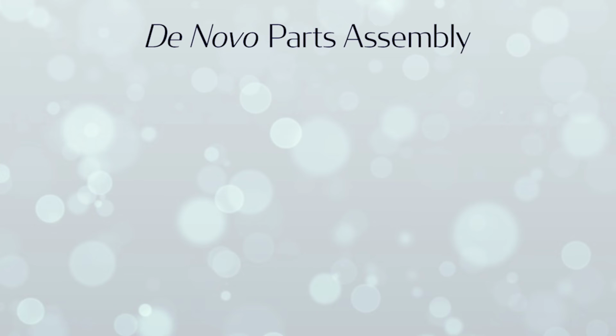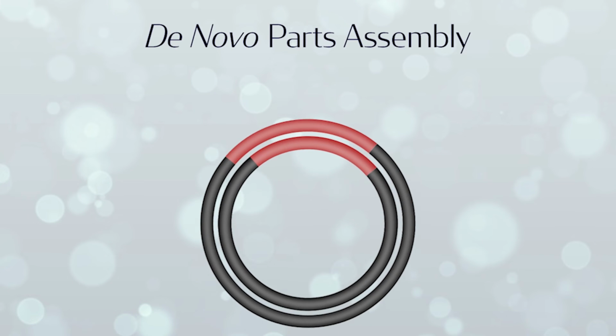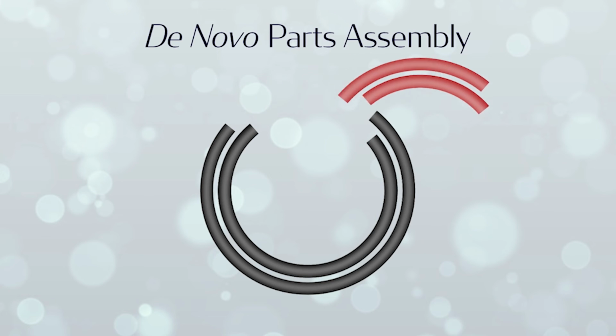A third application of oligo stitching is the de novo parts assembly. We use this method for generating prime editing guide RNAs, but this can be used to generate other sequences as well. The first step of this process is again the restriction enzyme digest. The acceptor plasmid is digested with the correct restriction enzymes, resulting in a linearized backbone. The second step is the Gibson assembly.